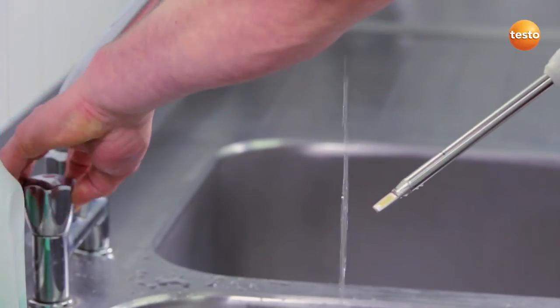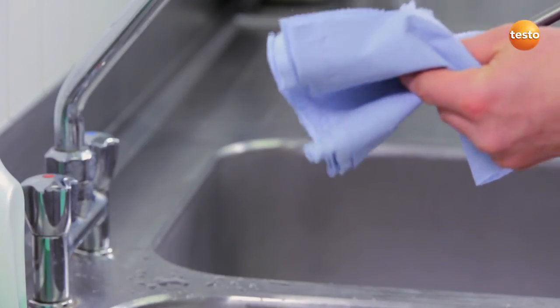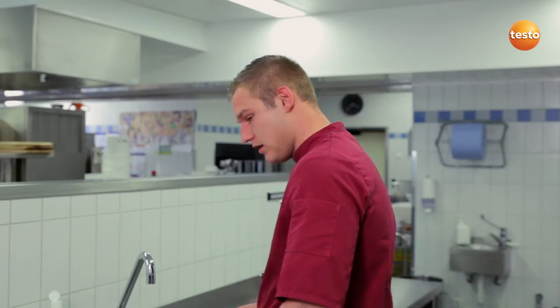And then simply dry it off carefully with a soft paper towel. Done! As you can see, with the Testo 270, I can very quickly determine the quality of my cooking oil. I adhere to the TPM limit values, ensure the quality of my oil and the deep-fried foods, and on top of that, I can reduce my expenses for cooking oil by up to 20%.